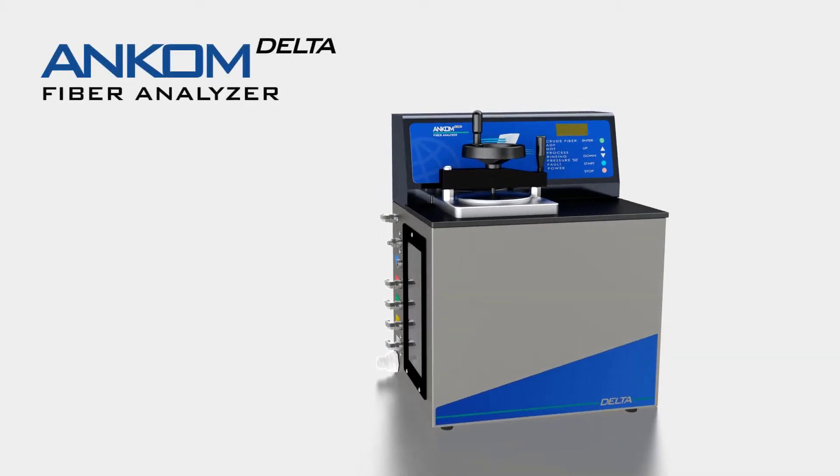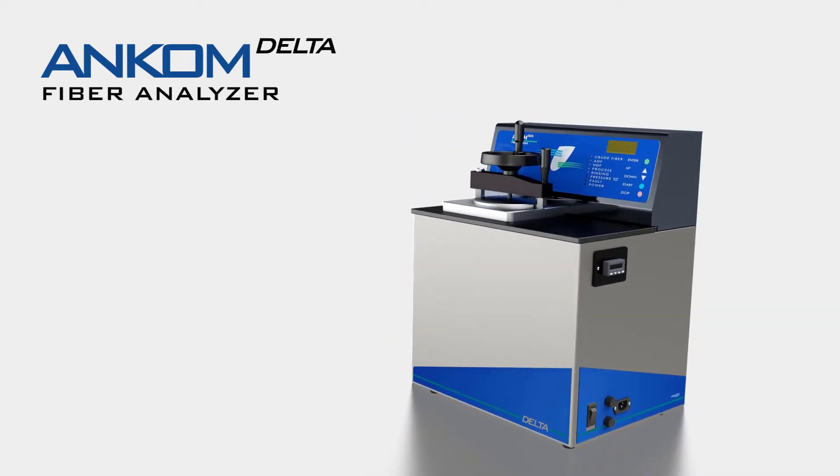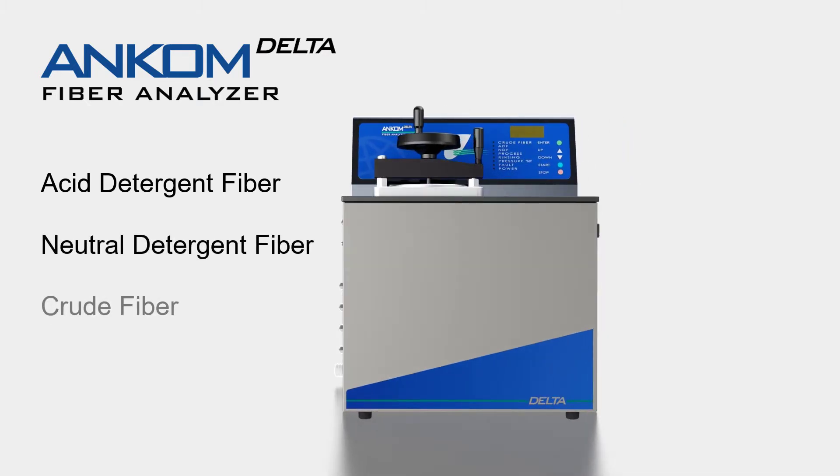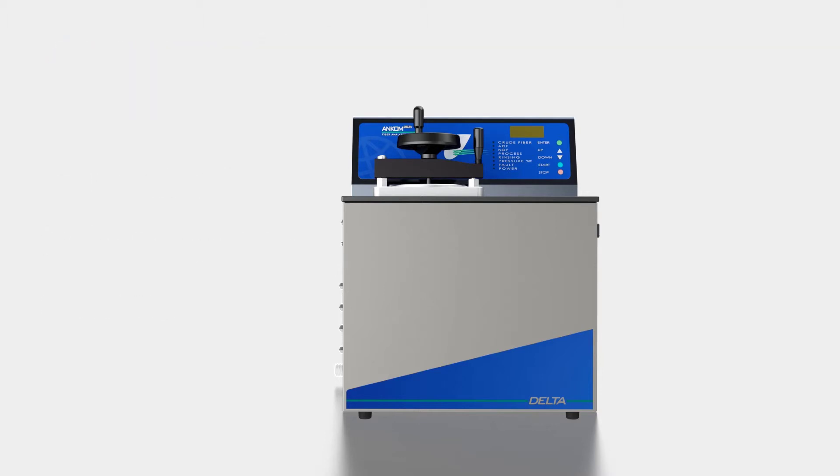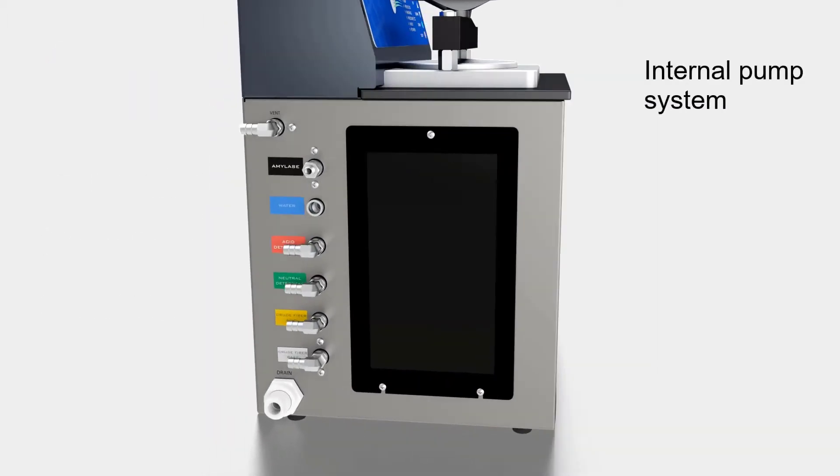The Ancom Delta fiber analyzer provides an automated, easy-to-use method for determining acid detergent fiber, neutral detergent fiber, and crude fiber values in feeds and forages. The Delta achieves automation at the highest level with an internal pump system.